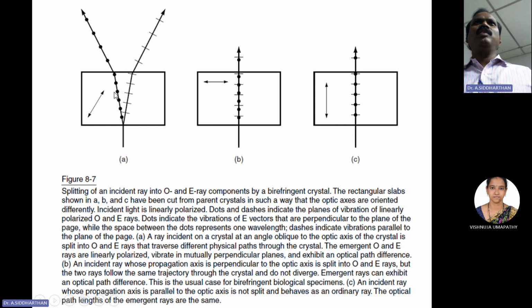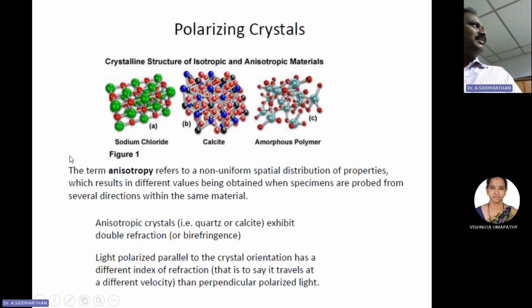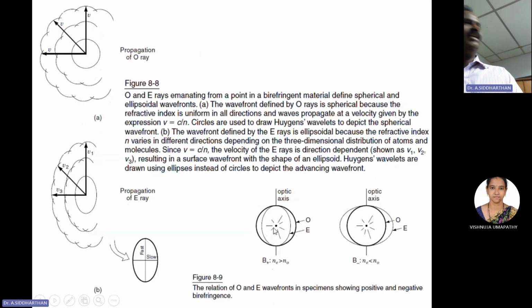A material is called birefringent when it has two paths, with one optic axis. The material may also have multiple paths, multiple axes. In all cases one ray goes in one path and another ray goes in a different path. So unpolarized light is polarized into two different pathways, and the speeds of these are varying.